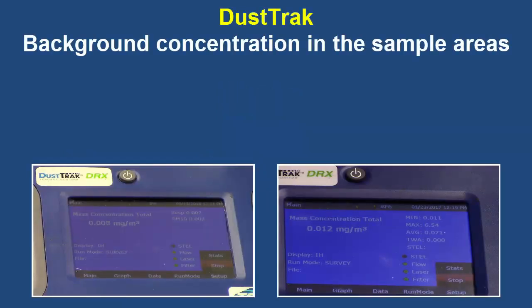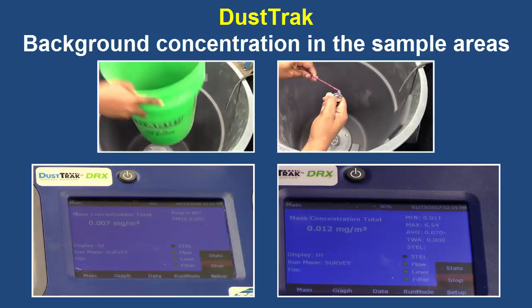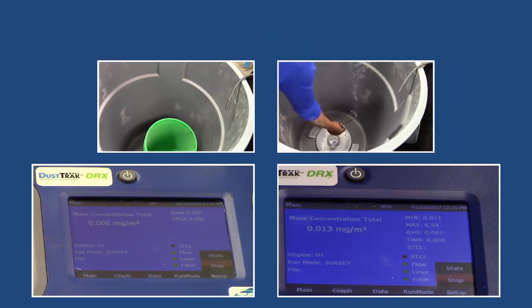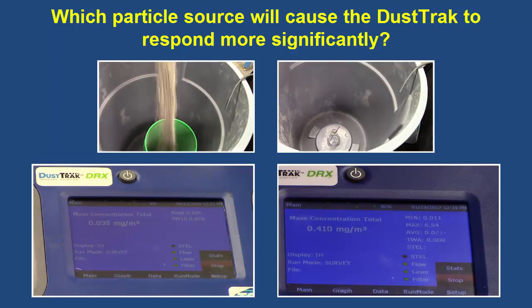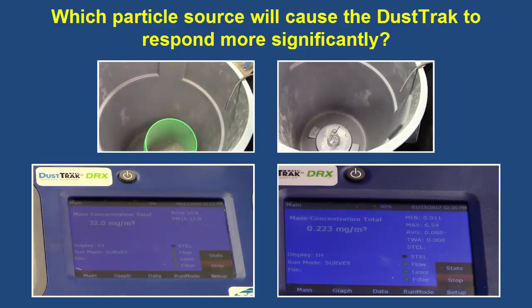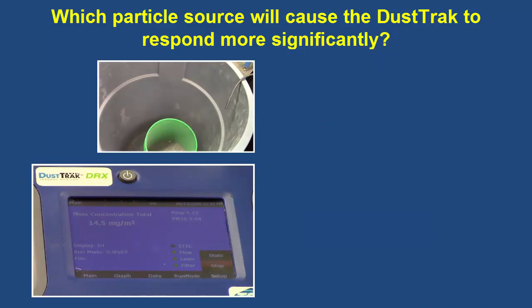Let's begin this activity by observing the DustTrak's response to the general background mass concentration of two sample areas. Now we'll introduce coarse or larger particles by pouring cat litter into a container and fine or smaller particles by lighting an incense stick with a lighter. How does the DustTrak respond to the two different particles generated? The DustTrak shows a significant increase in mass concentration with the cat litter compared to that of the incense stick.